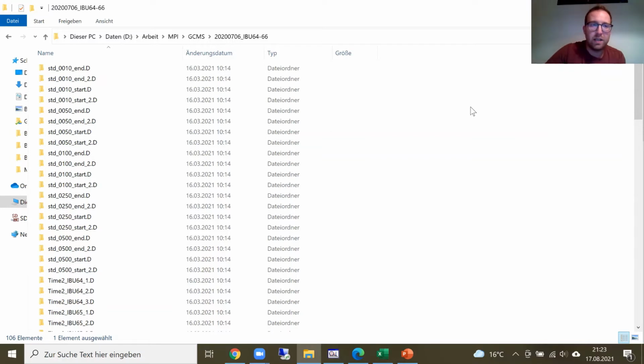That's why I'm usually analyzing the data not at the PC connected to the mass spec, but at my office PC. And that's why I'm using the GNPS dashboard.